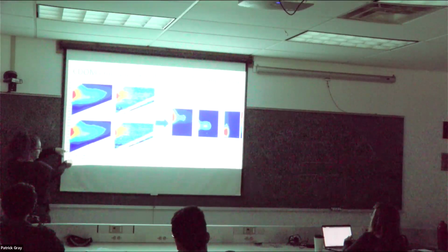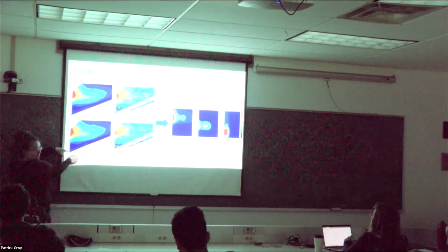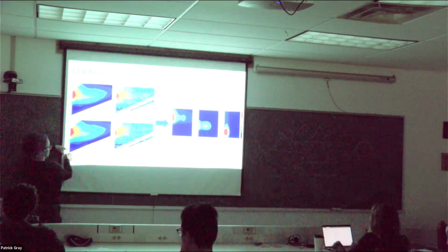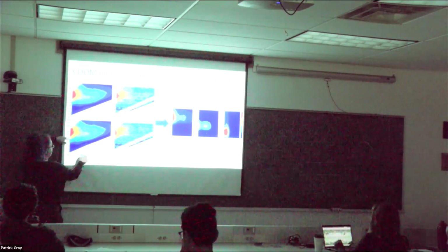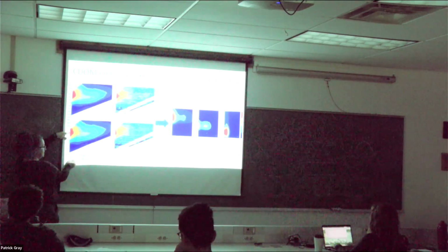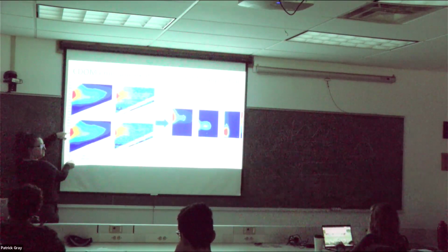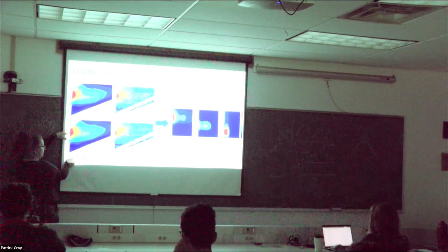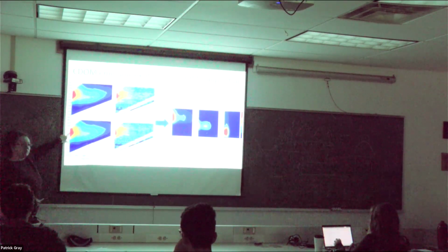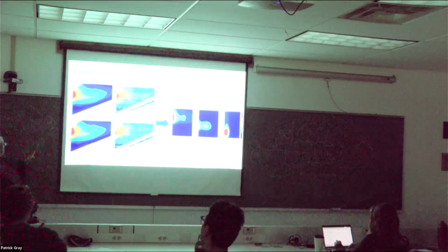So you excite at 250 to 275, and you're looking, is there any fluorescence? Nothing, no? So then you go to the next one. You run the excitation, you measure this way, and nothing. Oh, so we know when we hit whatever is in this water with excitation light of 250 nanometers, we're going to get some fluorescence at 450 nanometers. So you can do that and make these magical graphs.